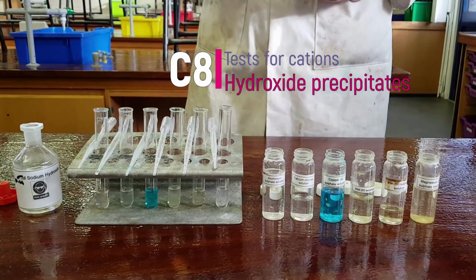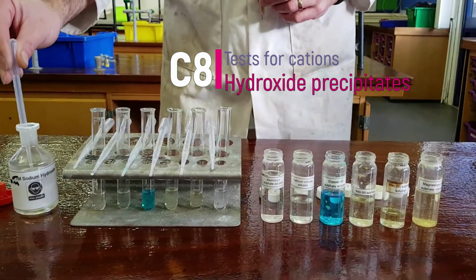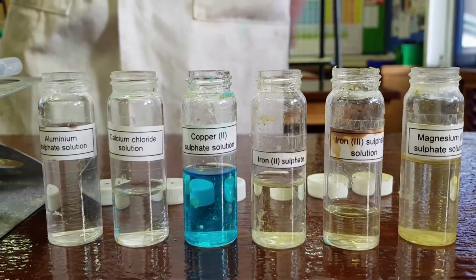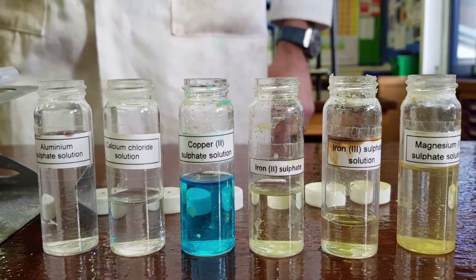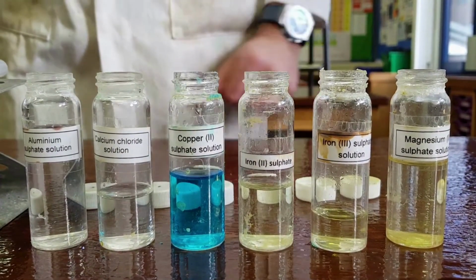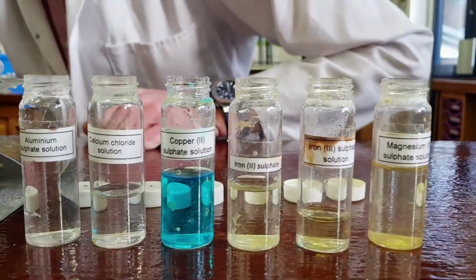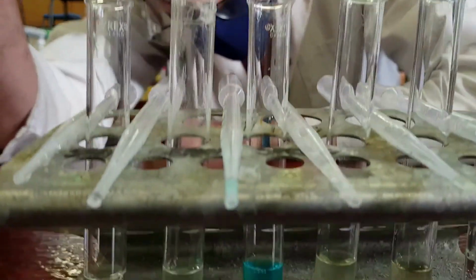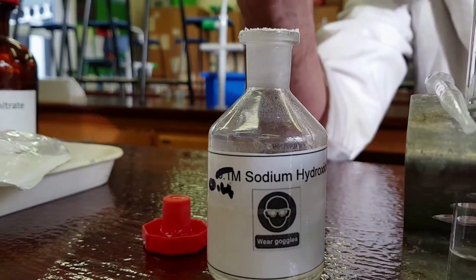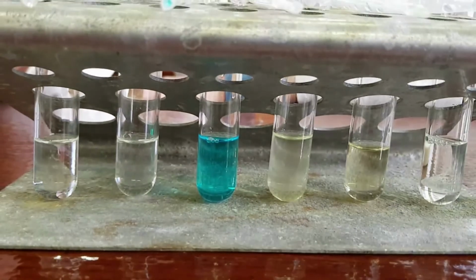So, this is the second video showing you the tests for cations, that is the positive metal ions that you find in salt solutions. And in this experiment we're going to be looking at the tests for aluminium, calcium, copper 2, iron 2, iron 3 and magnesium ions. Each of these solutions has been put into a test tube, and Mr. Reeves is going to add a few drops initially, and that is really important, a few drops of sodium hydroxide.